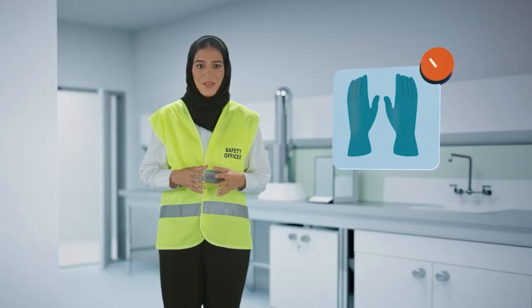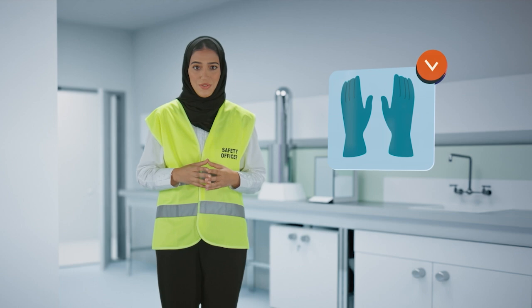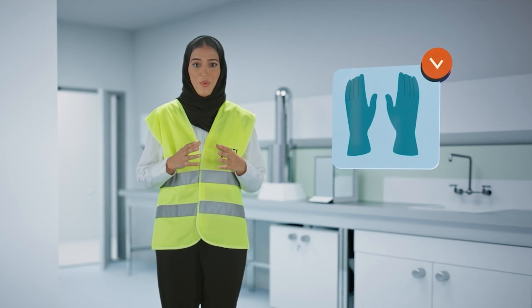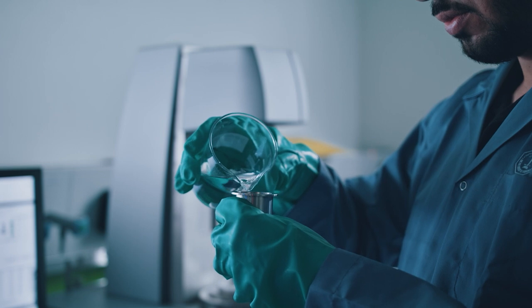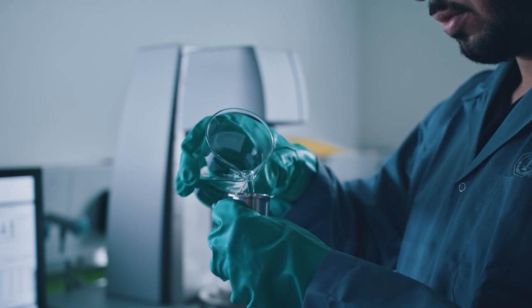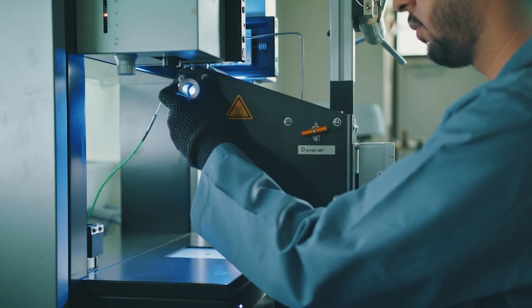Gloves are an important part of personal protection. Your instructor will assess the risks of hazards, which will require the use of gloves when appropriate, and will offer the appropriate type of gloves. Glove material must be selected based on the chemicals being used. Always check your gloves before each use to ensure the absence of cracks and small holes.